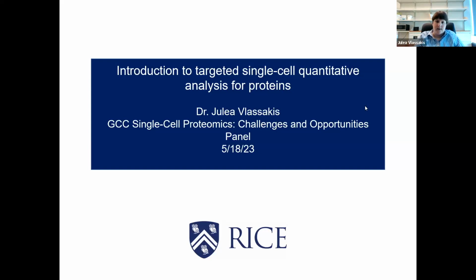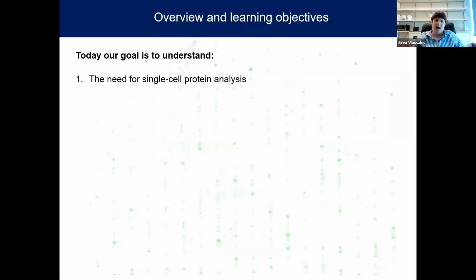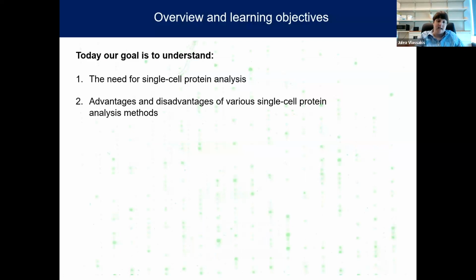And so today, I want to first motivate the need for single cell protein analysis. I'll talk about advantages and disadvantages of various single cell protein analysis methods, again, of the targeted variety. And we'll get into what I mean by that versus discovery aspect proteomics shortly.